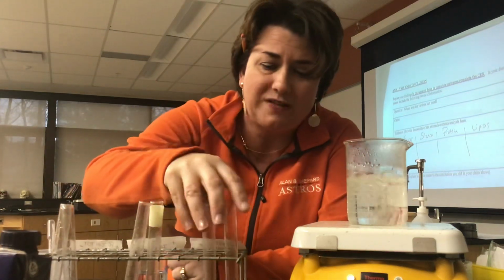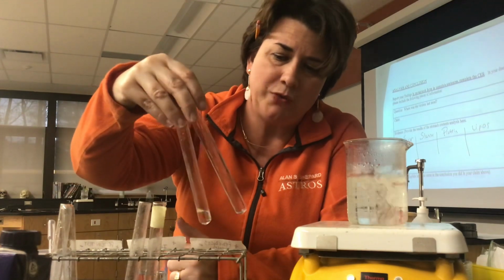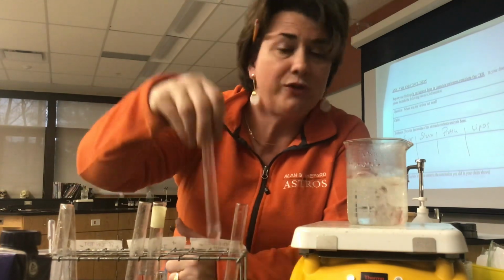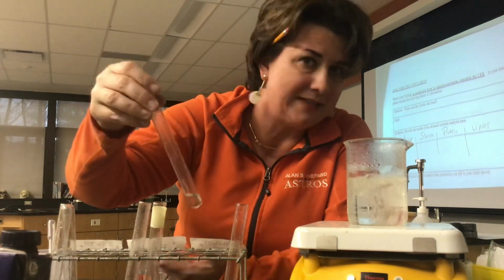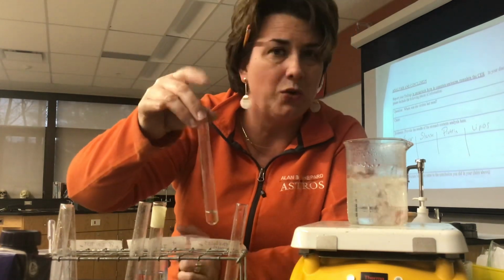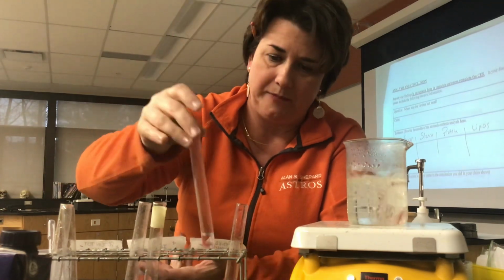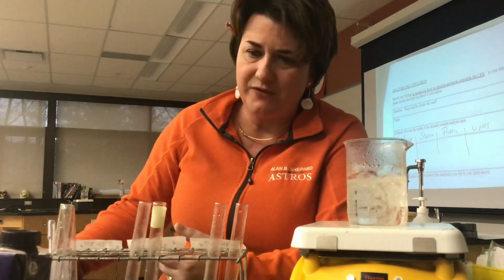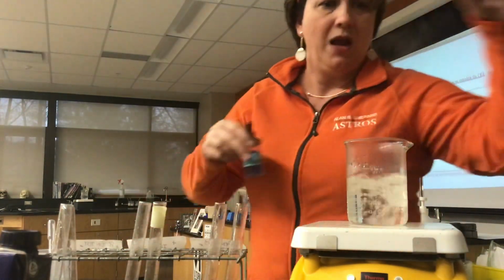So we started by running a positive and a negative control. In doing this, our negative control for each test is going to just be water. Water obviously isn't any of those four things. And so it's going to serve as sort of an example of what negative looks like. Now, for the positive tests, we've got kind of three reagents that we're going to use today.